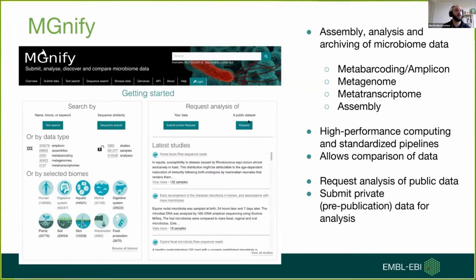As I mentioned before, I work on the MGnify team. We are responsible for the MGnify resource. This is basically a hub of metagenomics data. We are responsible for the assembly, analysis, and archiving of microbiome data.